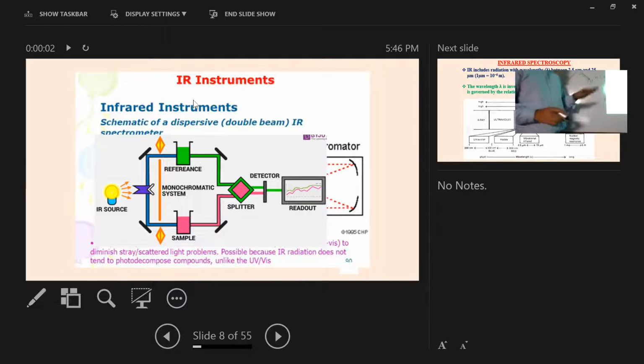So when the light of this source matches with this energy, that means this is our molecule. This is the wavelength from the molecule, what we are getting from the vibration. Now, if we give some light from the source that exactly corresponds to this wave, in that case, what will happen?